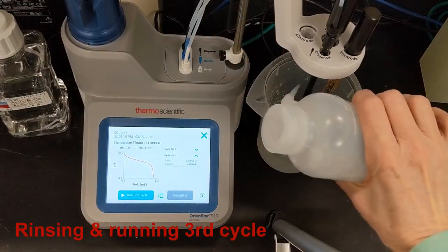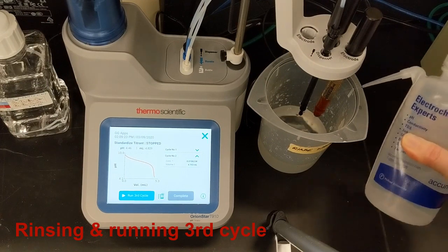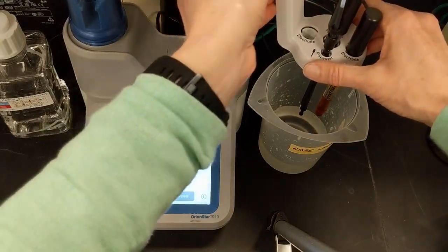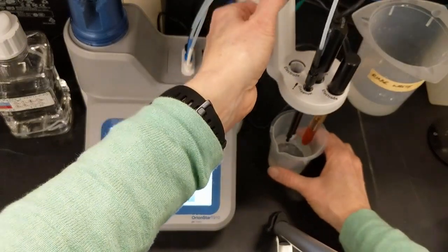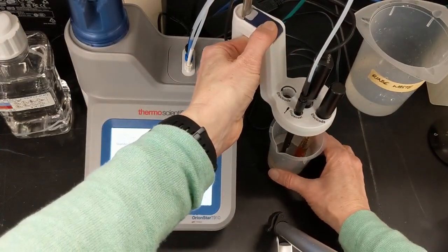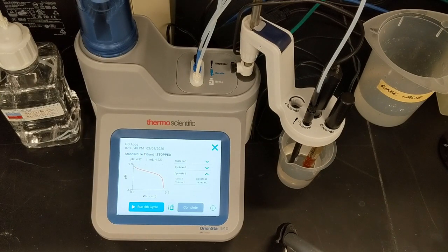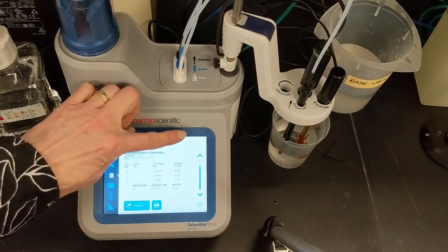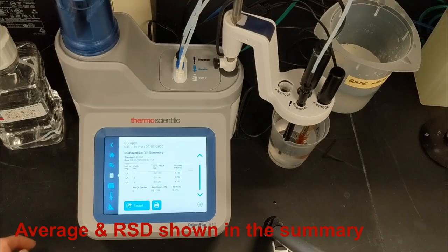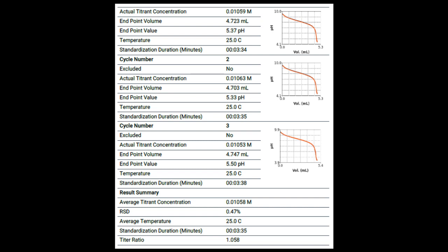I like to run three titration cycles for standardization because that increases my confidence in the results. The titrator will automatically calculate and display the average concentration of the titrant and the percent relative standard deviation, or RSD, of the average value, which shows how repeatable and reliable that titrant concentration is. I touch the run third cycle prompt to start the third titration of the standard. After the third titration cycle, I'm done and I select complete. In the summary screen, I can see the calculated concentration values from the three cycles, the average value, and the percent RSD. The standardization results are automatically saved to the titrant logs. When I view the standardization report, the details and results are present as shown here.